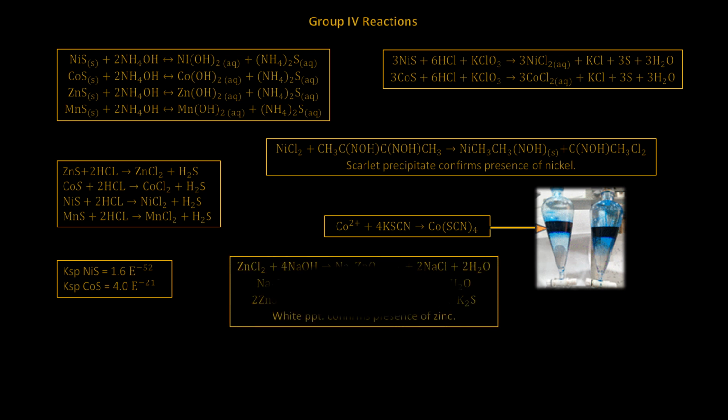For the zinc, the liquid portion is boiled to remove the sulfur as hydrogen sulfide gas. Sodium hydroxide is added to make the solution basic. It also forms a sodium-zinc oxide complex which is soluble. Passing hydrogen sulfide gas through the solution eliminates some of the free sulfur, which is soluble in a sodium solution. Potassium ferrocyanide is added, which combines with the zinc to form a non-soluble zinc ferrocyanide precipitate. This white-colored precipitate confirms the presence of the zinc.